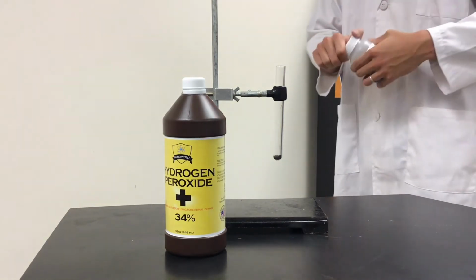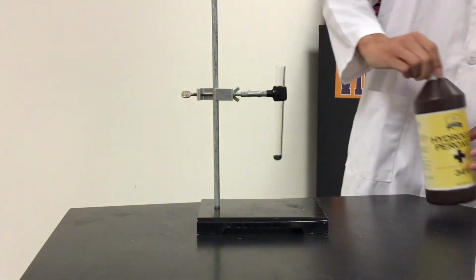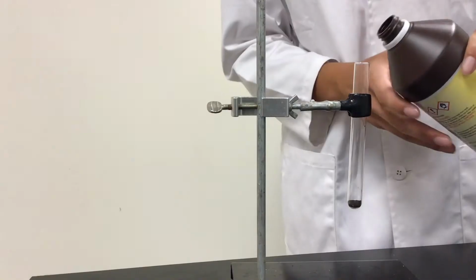So putting manganese dioxide in the bottom, then I will pour hydrogen peroxide into it.